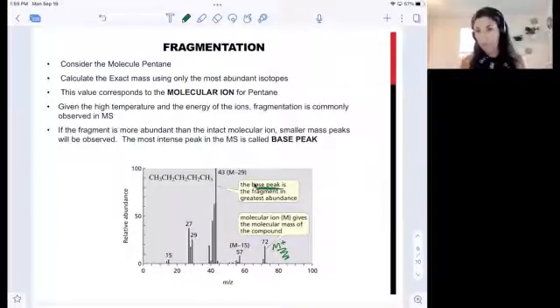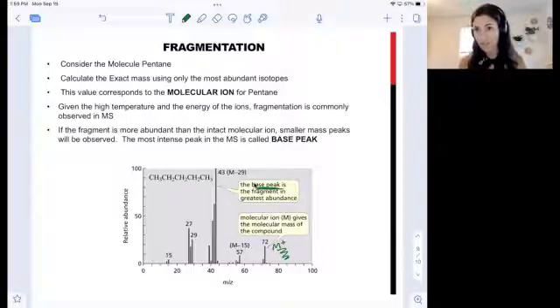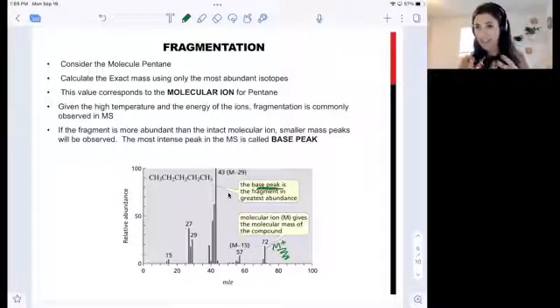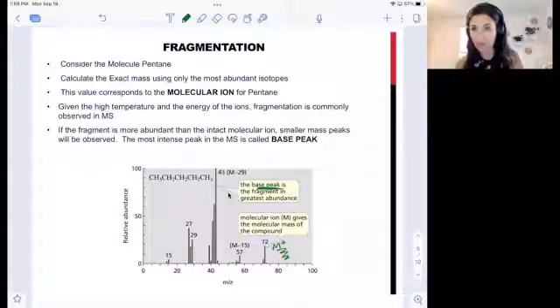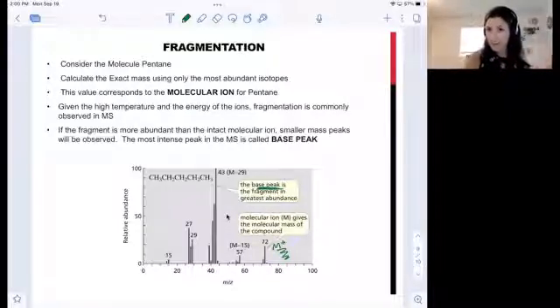Here in week 4, we're really going to be focused on the M plus, and you should each see an M plus that matches one of the compounds you're considering based on your week 3 data. In addition, you can use those bromine and chlorine and nitrogen signatures that we discussed earlier in the video to help differentiate your structure. And sometimes you may even see the bromine and the chlorine signature carry through to any of the fragments that also have bromine and chlorines.